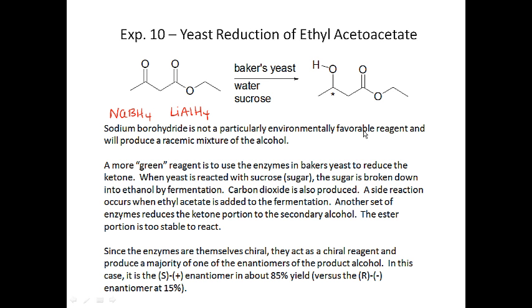So what happens in the main reaction is yeast reacts with sugar, sucrose, and that gets converted into ethanol by the process of fermentation. You probably have studied that in biology. Carbon dioxide is also produced in this reaction.